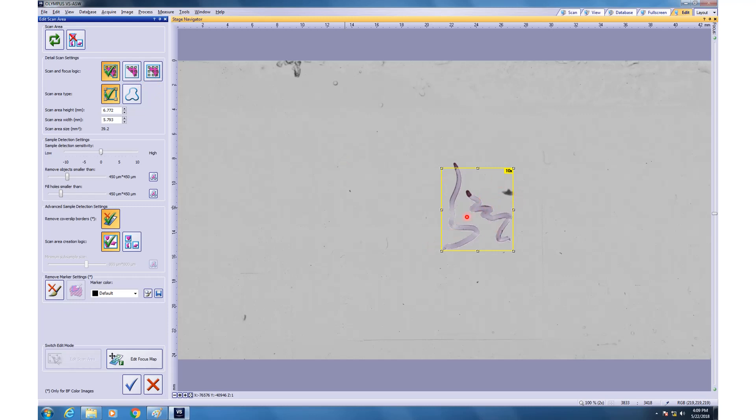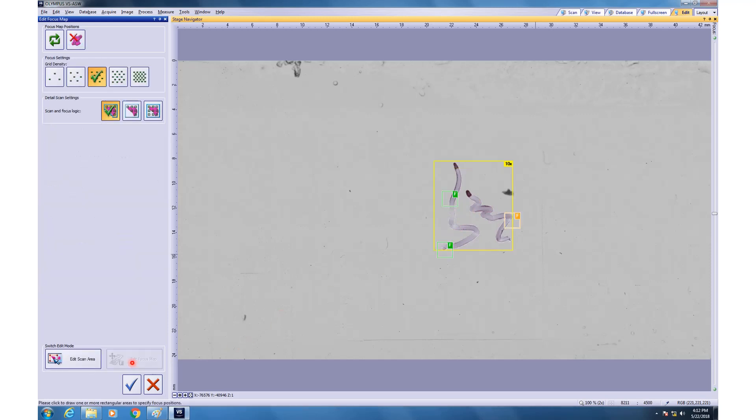Once you are done, then you click edit focus map. Now, you can see how many focal points would you like to have in the image. I know for sure that this object is very very flat. So, just a few spots will be good enough but in case your object is not in the single plane, then you can have more focal points or you can simply click and add or if you want to have lesser, then you can select these and delete these. Okay. Then once you are done with this, then click on this button.